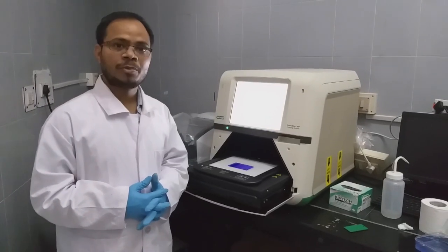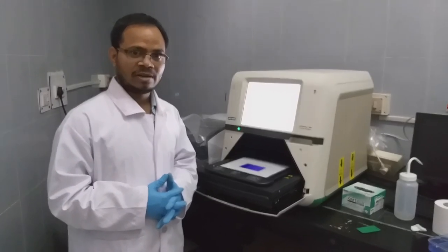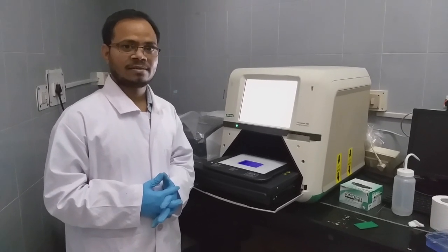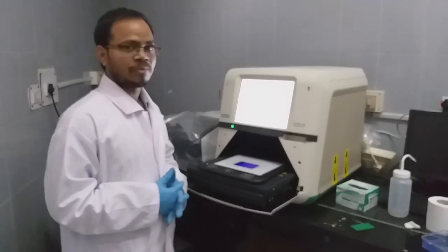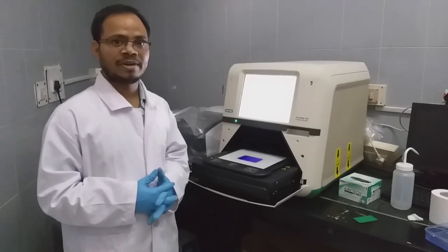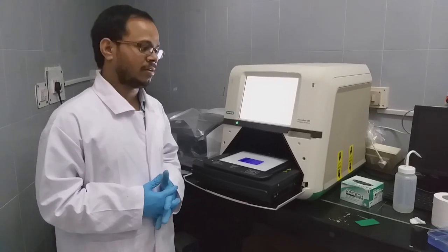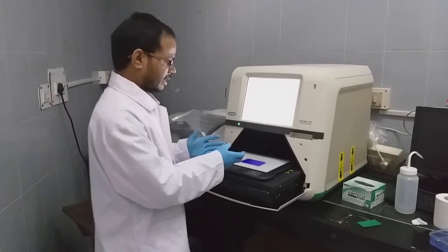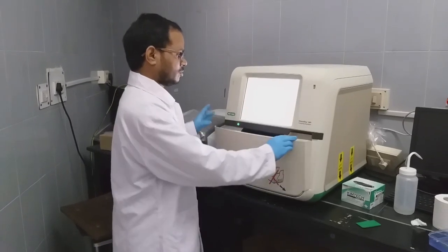So we purified the protein using nickel NTA column. We ran the gel and stained and destained. So now it's time to document the gel. We have to identify whether we got any single band fraction or not. So this is the gel I kept on a white tray. Now just close it.